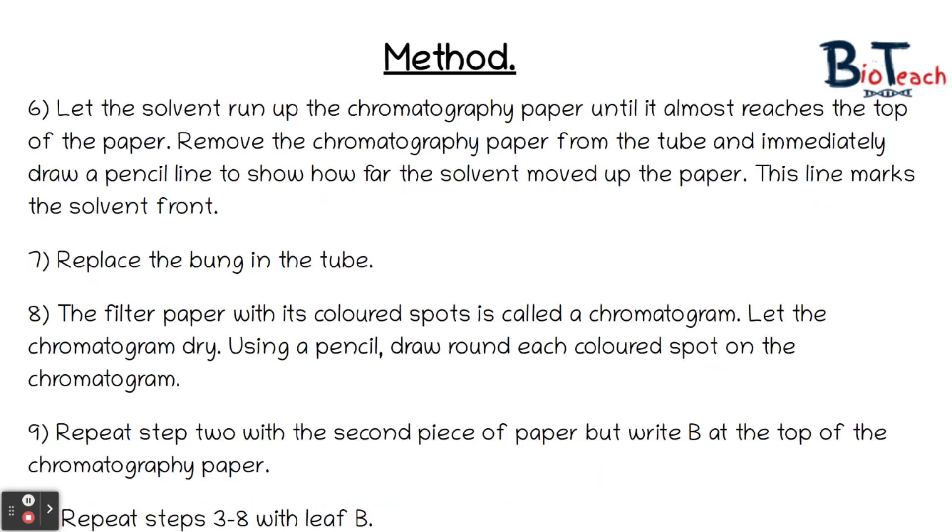The idea is to basically let the solvent run up the chromatography paper until it almost reaches the top of the paper. When it's almost there, maybe around a centimetre from the top, remove the chromatography paper from the tube and immediately draw a pencil line to show how far the solvent has moved up the paper. This marks what we call the solvent front, and it's a really important line to mark up otherwise you won't be able to do your RF calculations.